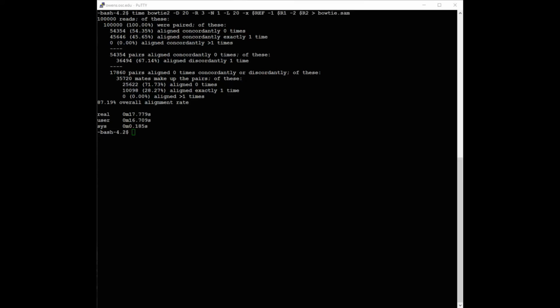And when you read the benchmark papers, you have to pay attention to those details. And the second, if you really want me to recommend a DNA sequence read aligner to start with, I would recommend BWA. And the BWA-MEM algorithm is pretty robust and is always a good starting point.